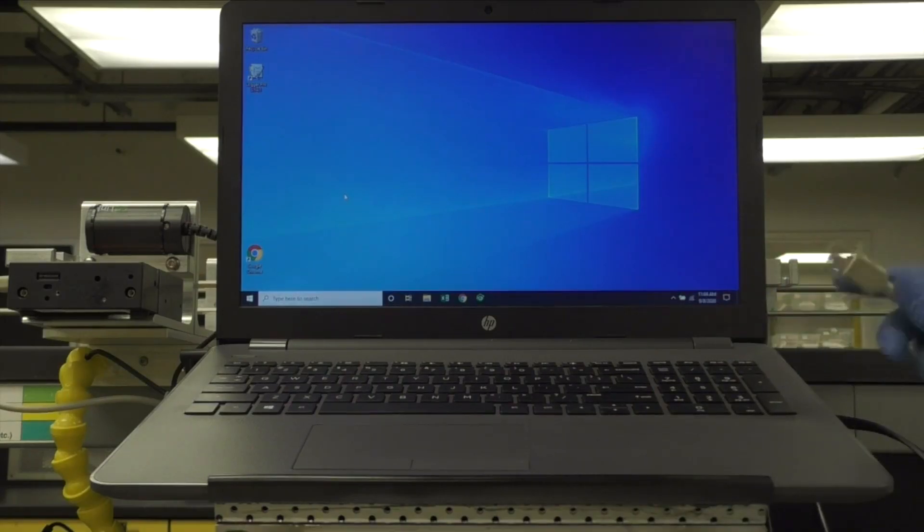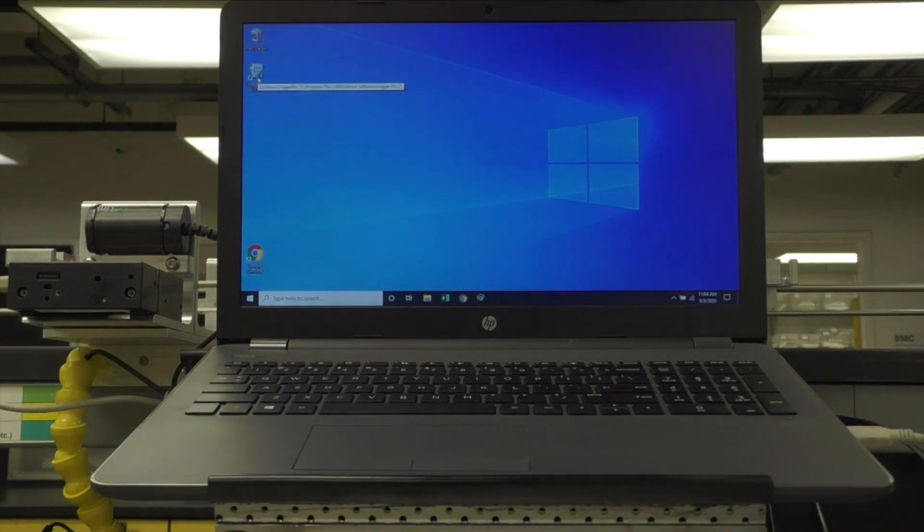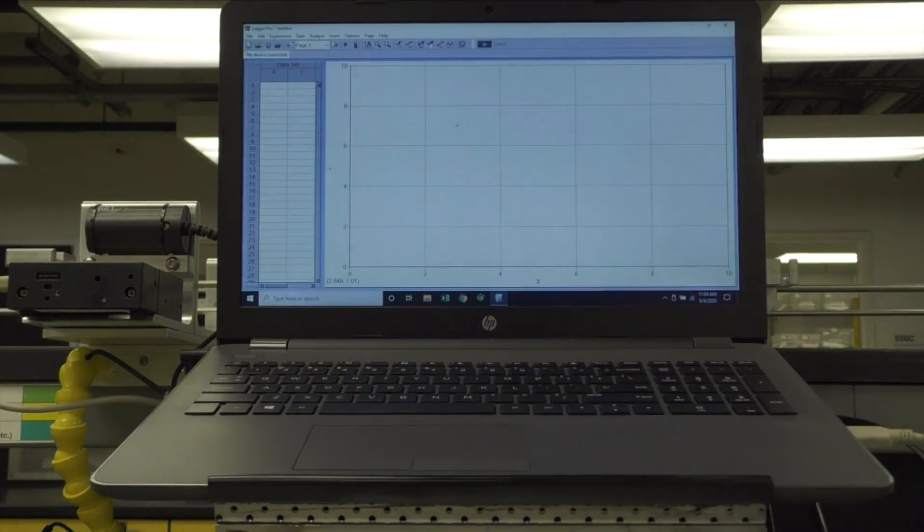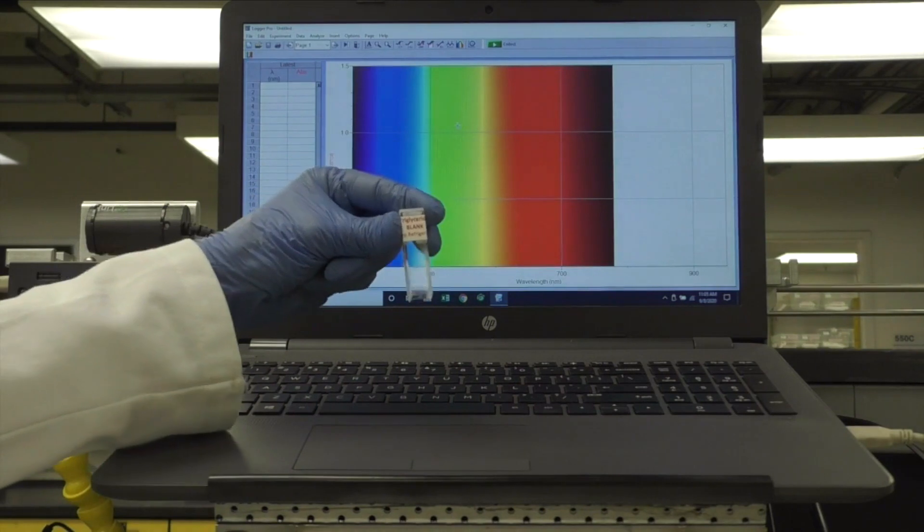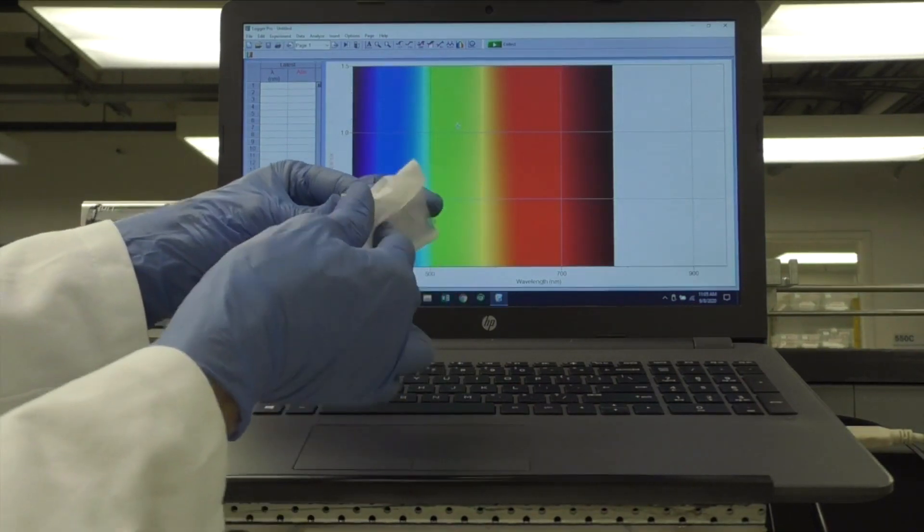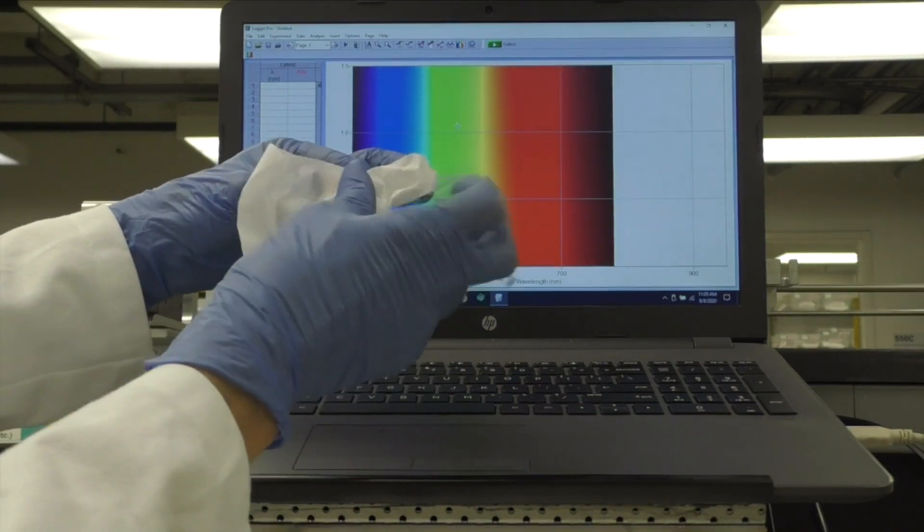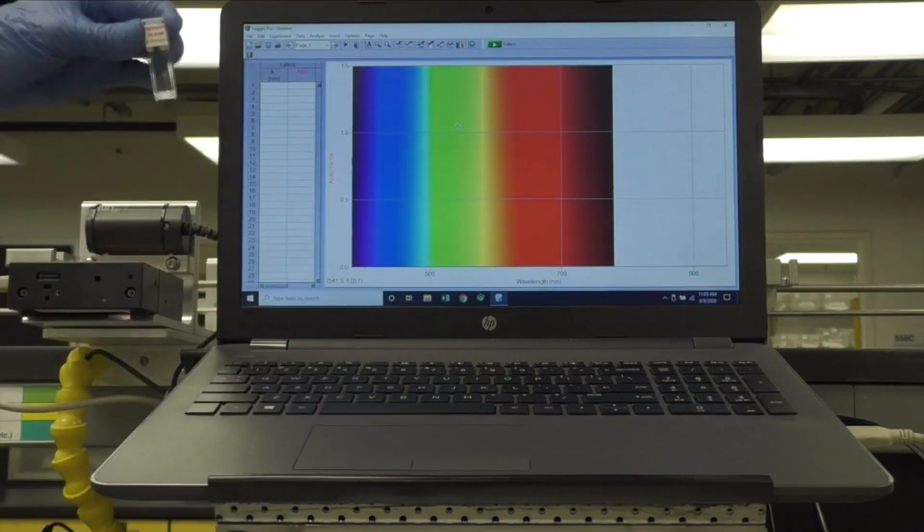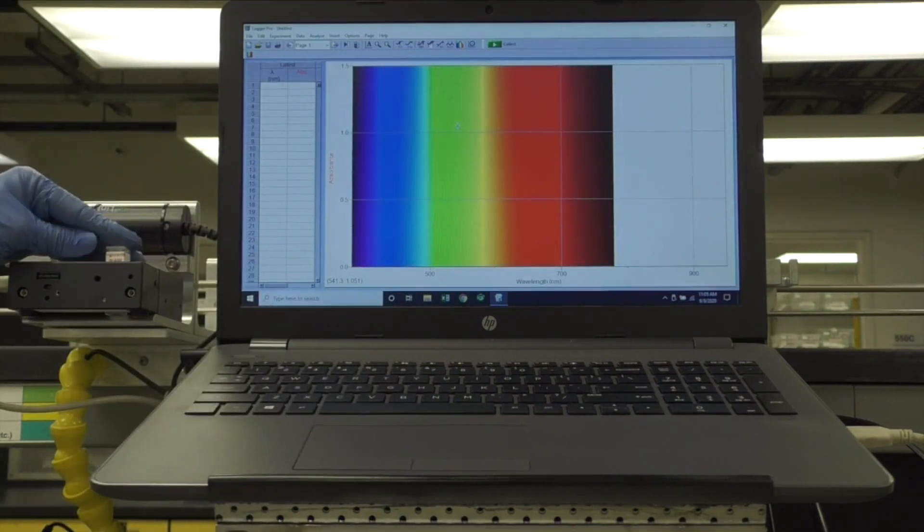Begin by plugging in the cable labeled with green tape and then opening LoggerPro. Using the prepared blank from your patient block, wipe it with a Kimwipe and place it in the spectrometer, being sure a clear side faces front.